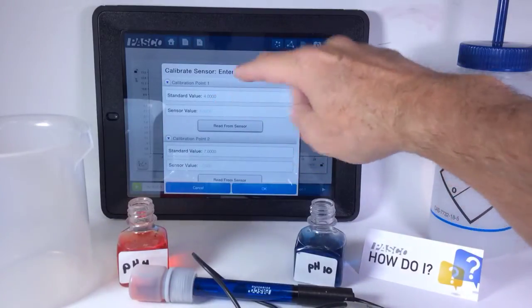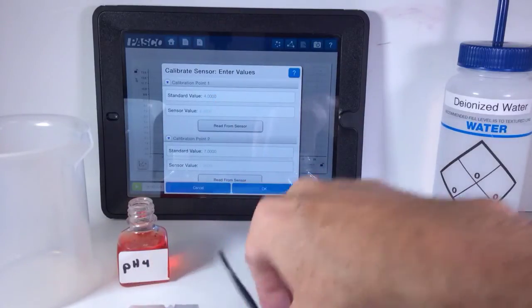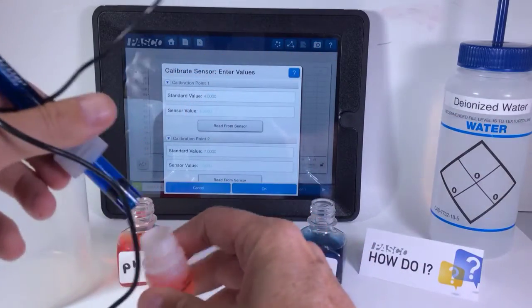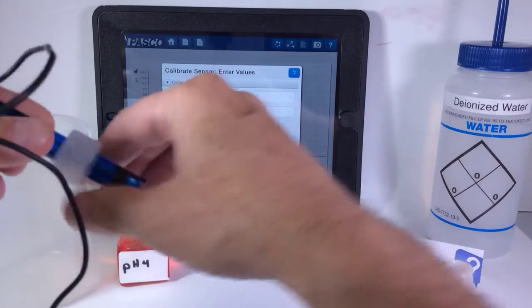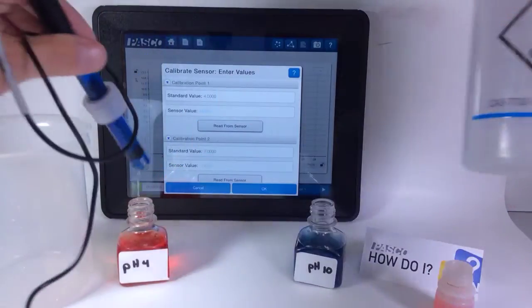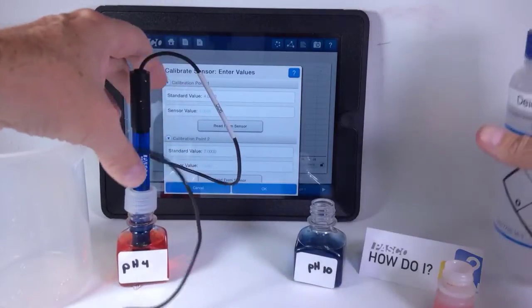And it says standard value 4. Notice that I do have a pH 4 buffer solution. I'm going to remove the pH probe from its stored solution, rinse it off, and place it into the pH 4 solution.